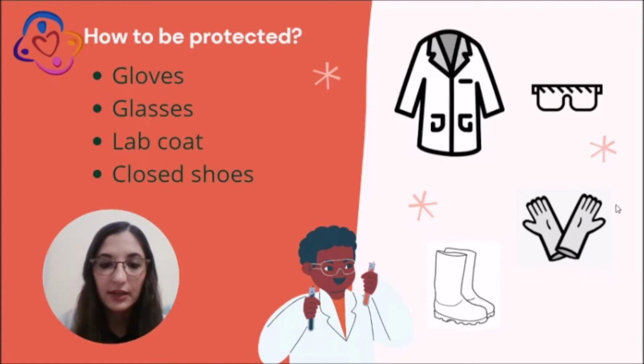For example, we have these boots that you see here, but they are not necessarily boots. You can use sneakers or closed shoes in general.